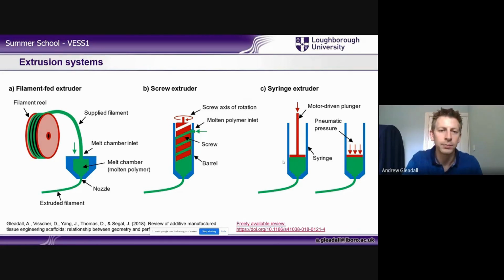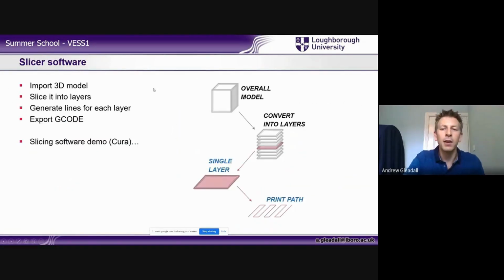And then the overall process that was briefly touched upon in that second video from the BioX printer: you get your 3D model, you bring it into your slicing software, into your 3D printer software, and it will convert that 3D model into cross-section slices. This is what I'm showing here. This cube has been sliced on the horizontal plane 8 times or 7 times to get these layers.